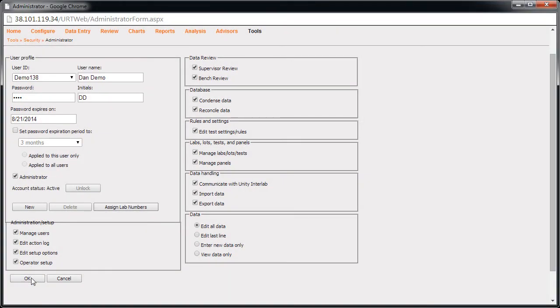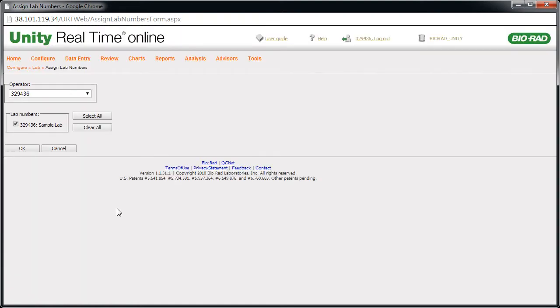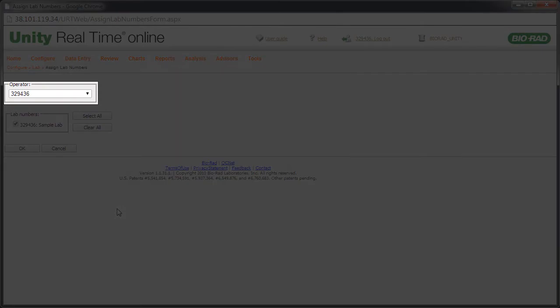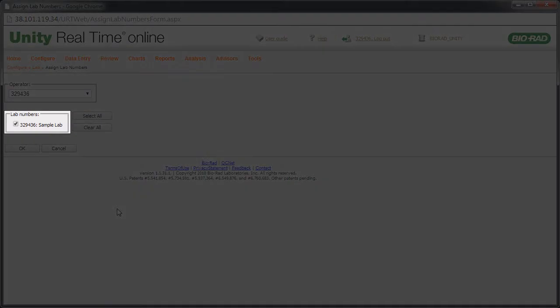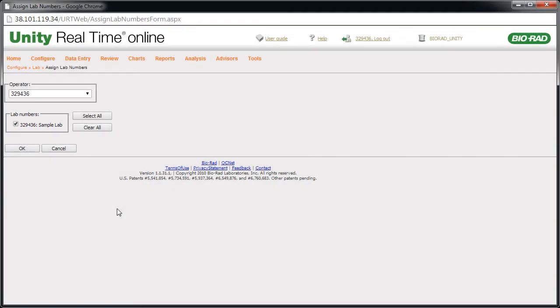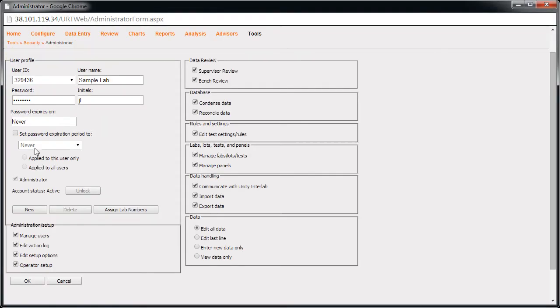Finish by assigning lab numbers to the user. This allows the user to view QC data in the software. Click the Assign Lab Numbers button. The Assign Lab Numbers page appears. Use the list to select the user you're setting up. Select one or more lab numbers to assign to the user. QC data is visible to the user based on these selections. Click OK. The user is now set up.